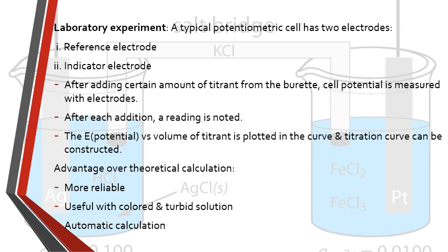In the weak acid, strong base titration, the curve has a more gradual rise with a less sharp equivalence point, and the buffer region, where the solution resists changes in the pH, is more pronounced. While in redox titration, the curve might show distinct steps corresponding to the oxidation and reduction of different species.